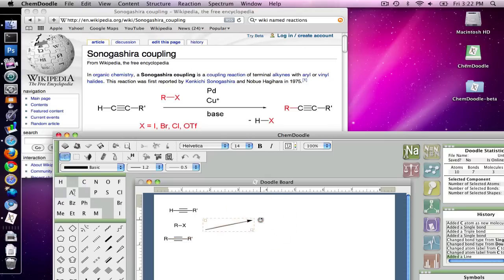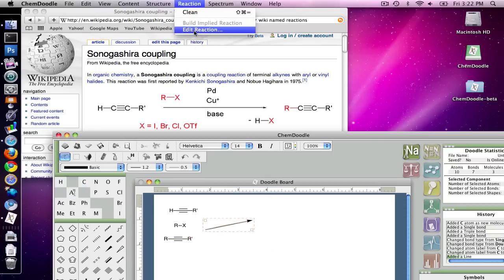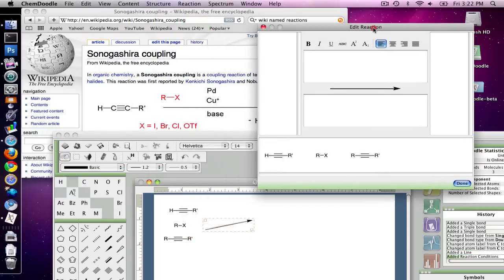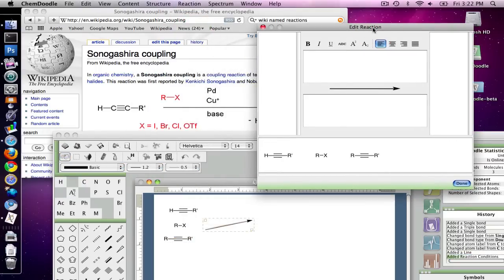So I'm just going to select the arrow, I'm going to go to reaction, edit reaction, and the edit reaction interface will pop up.